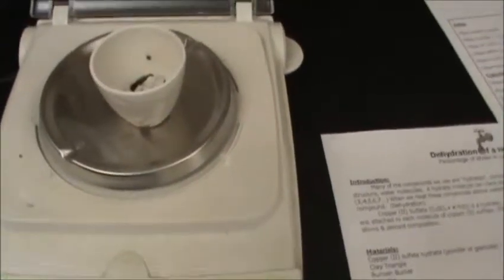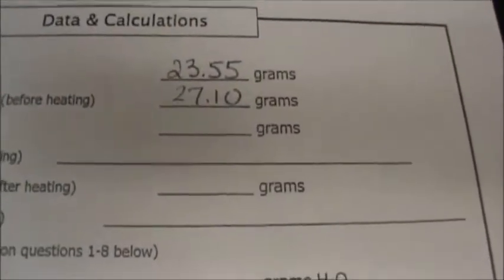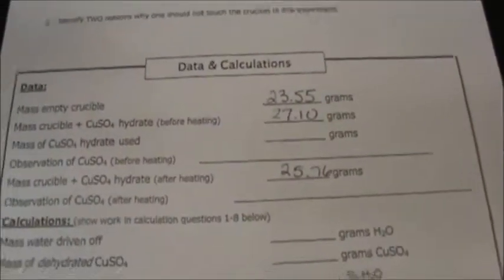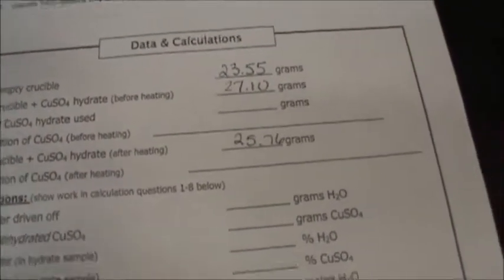So this should pretty much finish up your entire procedure. There's really nothing else to do other than cleaning up. Like it says at the very bottom, chemical disposal, and I'll take care of that off camera. You have the work ahead of you to actually calculate. Your calculations section, you should have everything filled in at the very top. I left all this stuff blank, but I could probably fill in my 25.76 grams of my crucible and my copper sulfate after I heated it, so it's completely dried out.